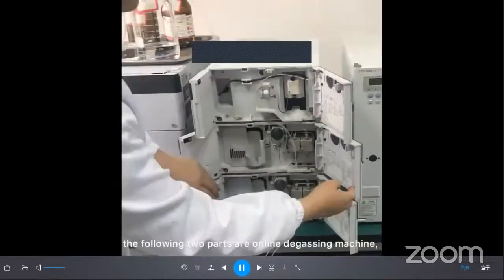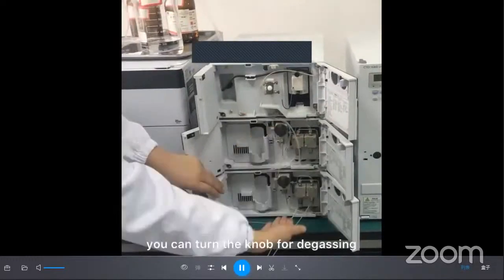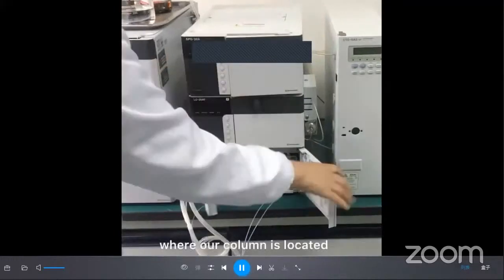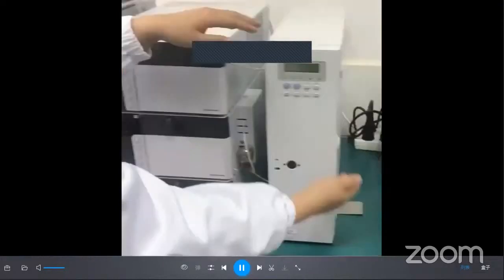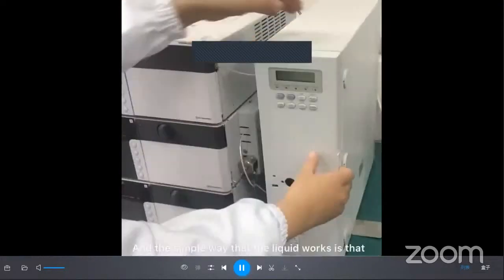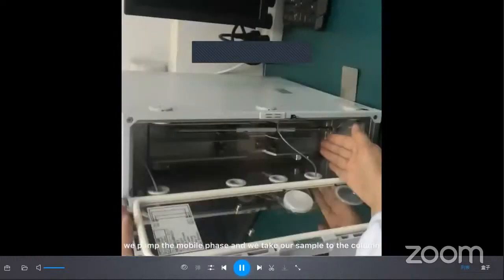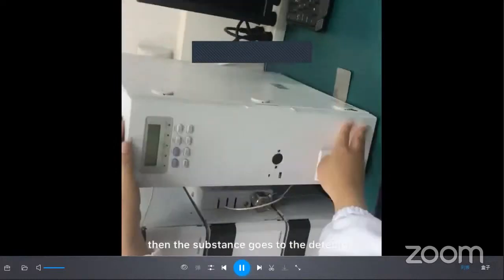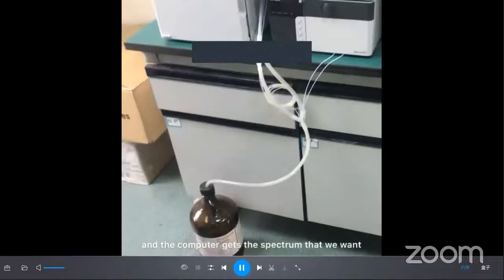The following 2 parts are the online degassing machine. You can turn the knob for degassing. The next part is the column temperature chamber, where our column is located. And the simple way that the liquid chromatograph works is that we pump the mobile phase and take our sample to the column. We use the column to separate the substances. Then the substance goes to the detector. The detector sends the signal to the computer, and the computer gets the spectrum that we want.